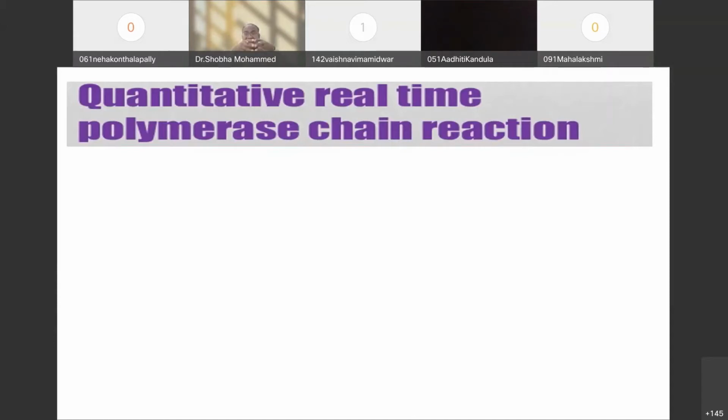of that particular DNA in the body, the load of that protein molecule in the body, or the load of that protein molecule in the fluid, a load of that particular DNA in the nucleotide fluid or in the tissue fluid. So when I want to read that, it's very important for me to understand the quantitative real-time polymerase chain reaction. The quantitative analysis will provide me the load of that particular antigen.